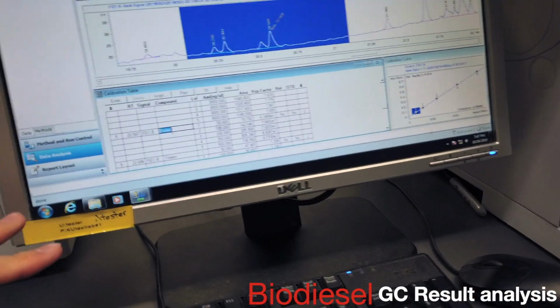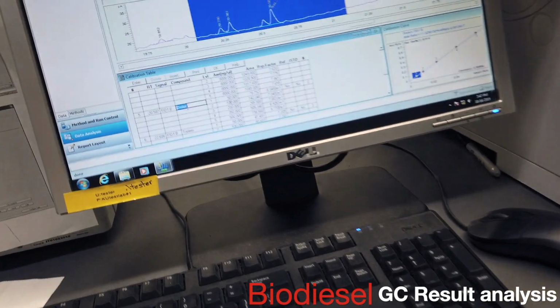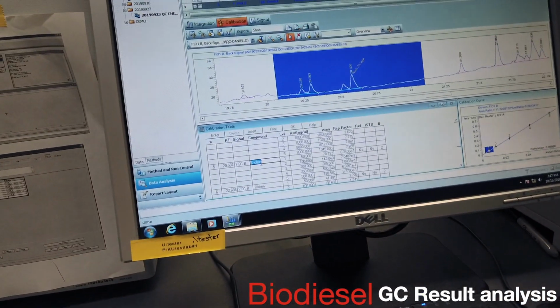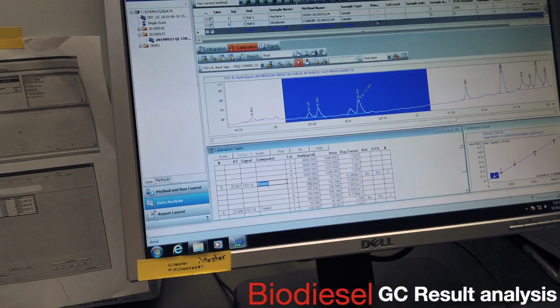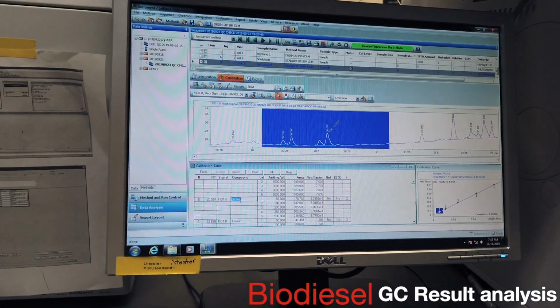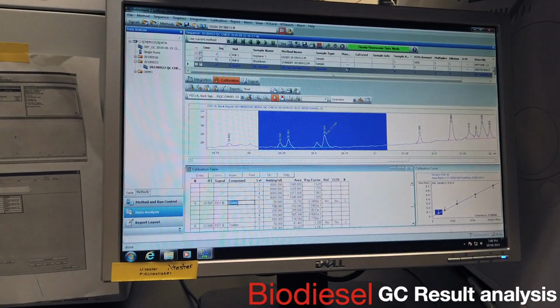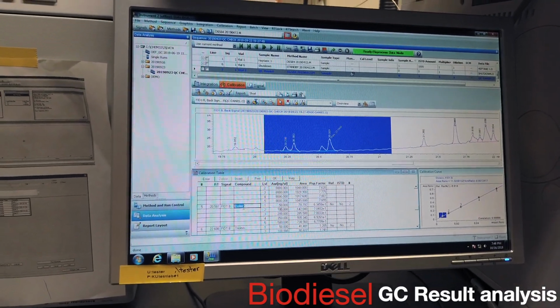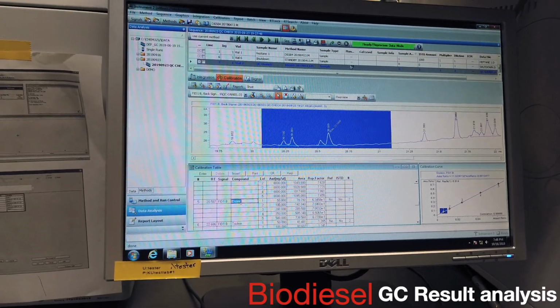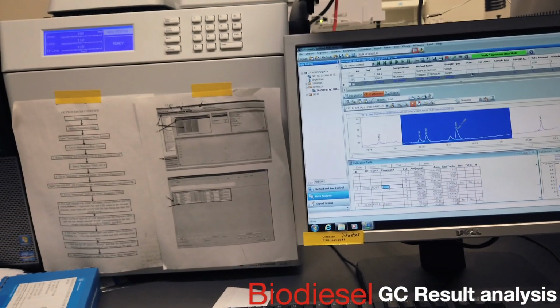In the future, do we have to identify the area ourselves first, or can we just click it and the blue will come out? You should be able to click it. Now, it might shift over time, so you might need to. But these windows are so wide, probably not. Okay. But the important part is to check every time. Just don't assume. Just check. Okay. Yeah.